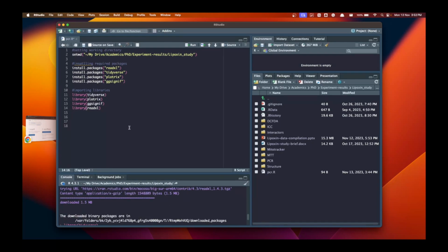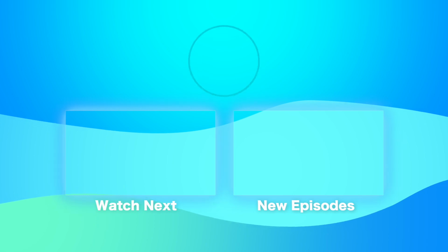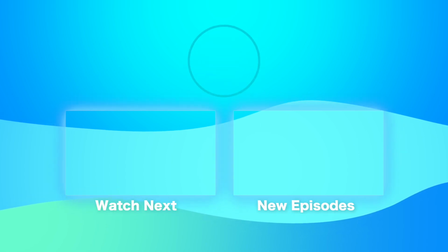All right, so till now what we did was setting up our working directory, installing the required packages, and importing the libraries. So let's keep it up till here for this video, and in the next one we are going to see how we can import data from an Excel sheet and start cleaning that data, or start to reorganize that data. So on to the next.